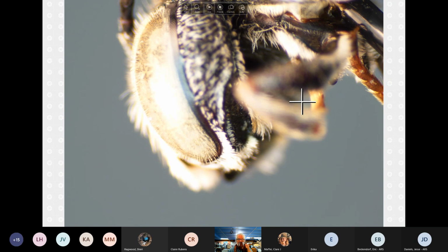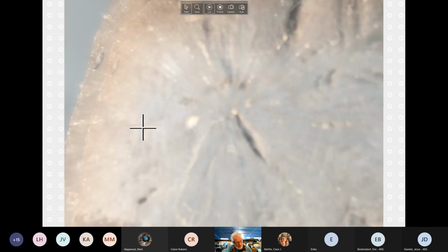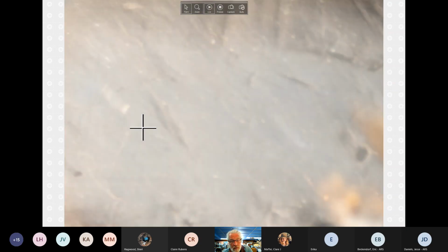It's part of just memorizing general patterns. Note the hair on the eyes, a good character for Coelioxys, as if you need more. So now at this point, I'm going to invert the specimen so we can take a quick look and tour of its sternites. Looking at sternites often is problematic because the specimen is upside down, and flipping a specimen upside down can be tricky for people.